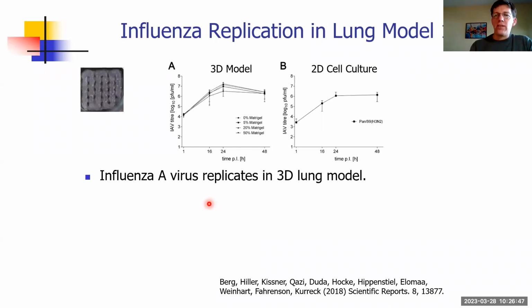Our background actually is that we are infection biologists. So we have a long-term experience with virus research. But as I mentioned in my introduction, we think that the animal models do not reflect well the course of disease in a human infection. That is our motivation to produce these bioprinted organ models. And so we infected our organ models with influenza virus.